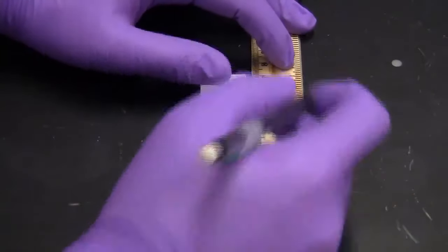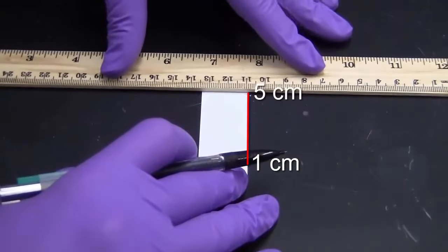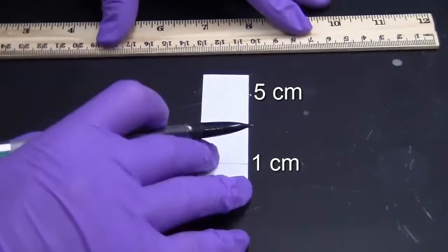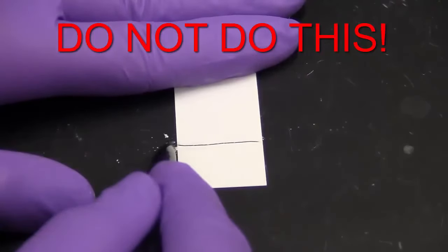Using a pencil and ruler, draw a line 1 cm from the bottom of the plate, then another line 5 cm above the first line. These lines indicate your start and finish. Draw the lines lightly to avoid scratching the silica off of the plate.